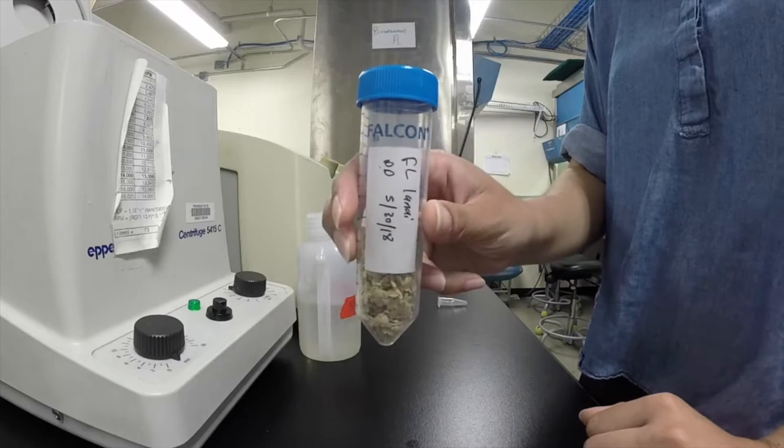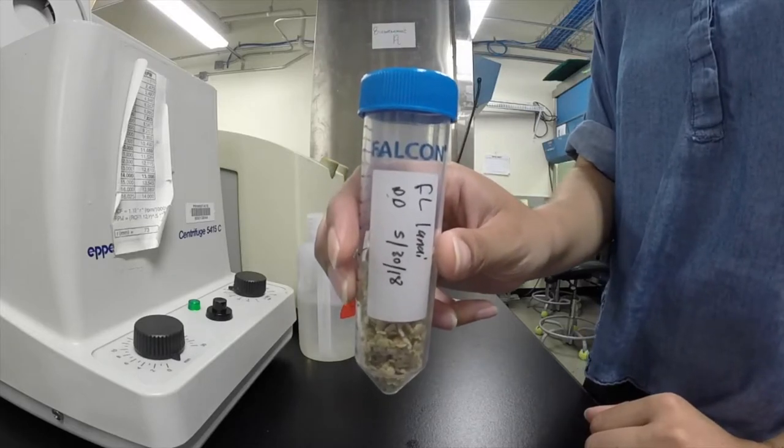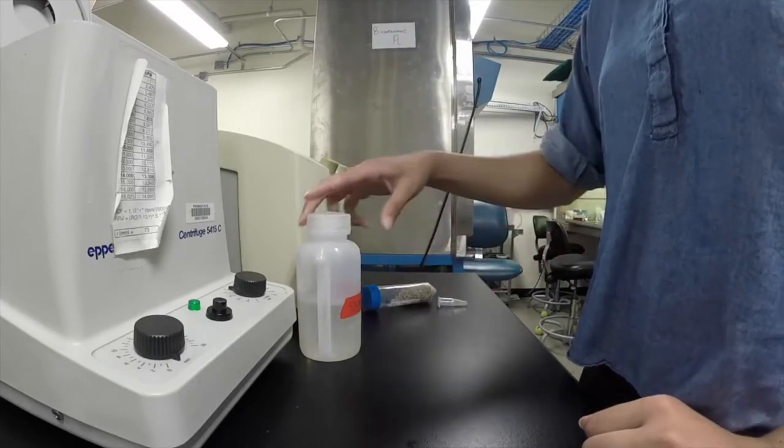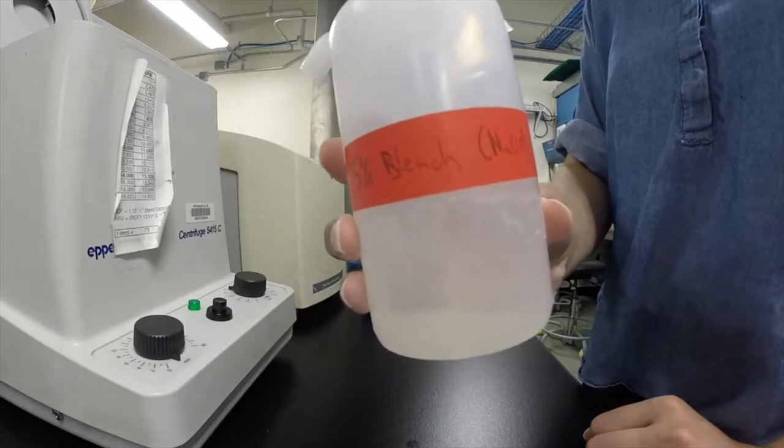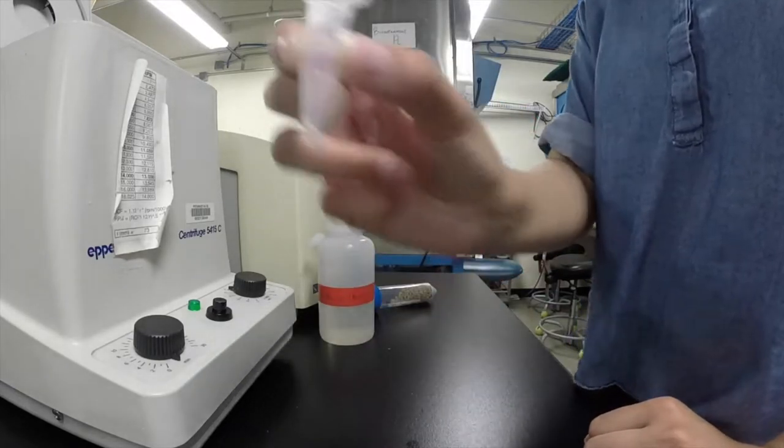We have our seeds that we had gotten from before in the seed fruit. We have some 5% bleach and we have an epi tube.